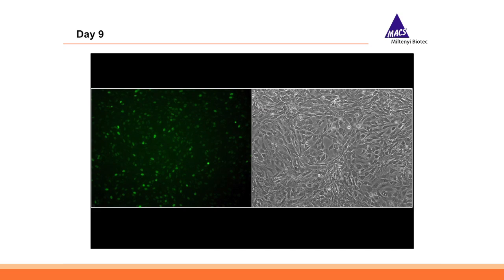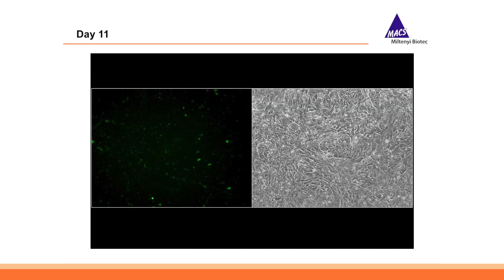Here there are very dense parts, and you see maybe there's a little bit enhancement of the size of the nuclei, which is normal for ES cells, but still the efficiency is very high. And then very obvious on day 11, this is what you want to get out at the end of reprogramming. This is a nicely formed iPSC colony.